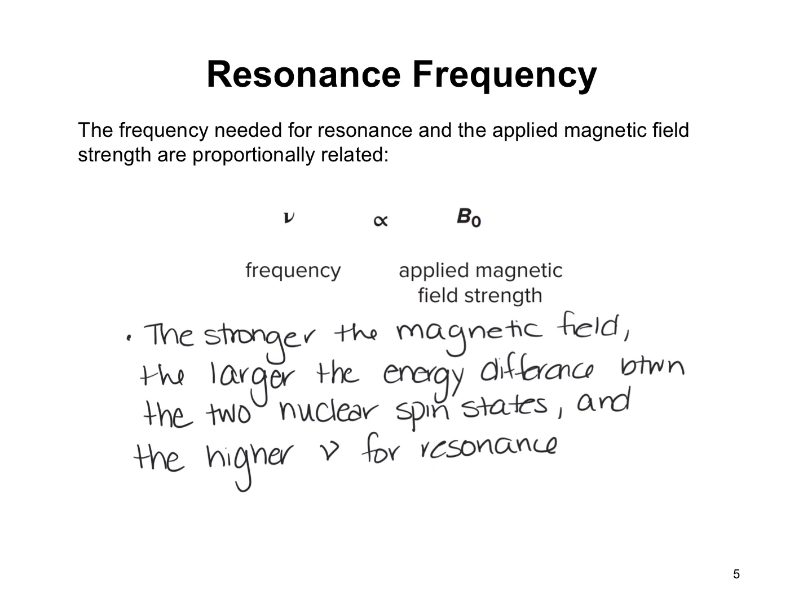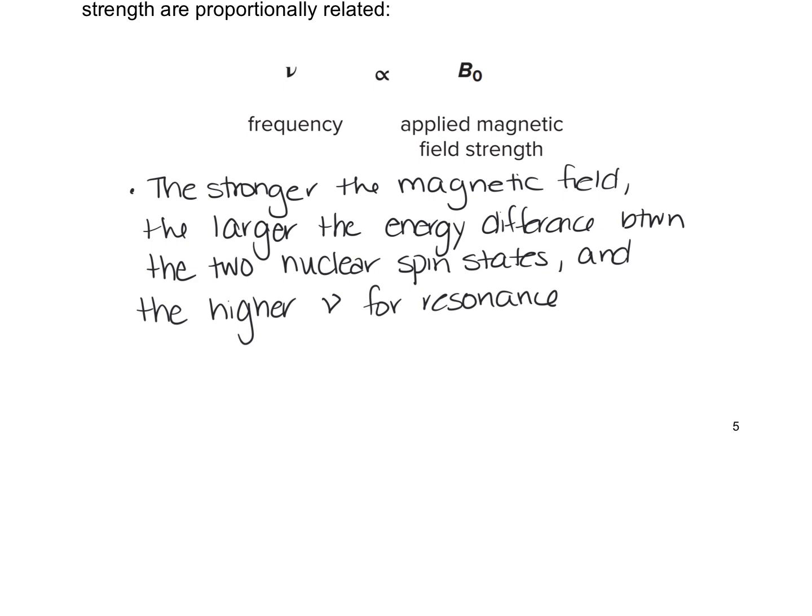Okay, so NMR spectra are a lot of times referred to by their resonance, like 300 megahertz instruments or 500 megahertz instruments. It really depends on the frequency of the RF radiation used for resonance. These spectrometers use really powerful magnets to create a small but measurable energy difference between those two possible spin states.